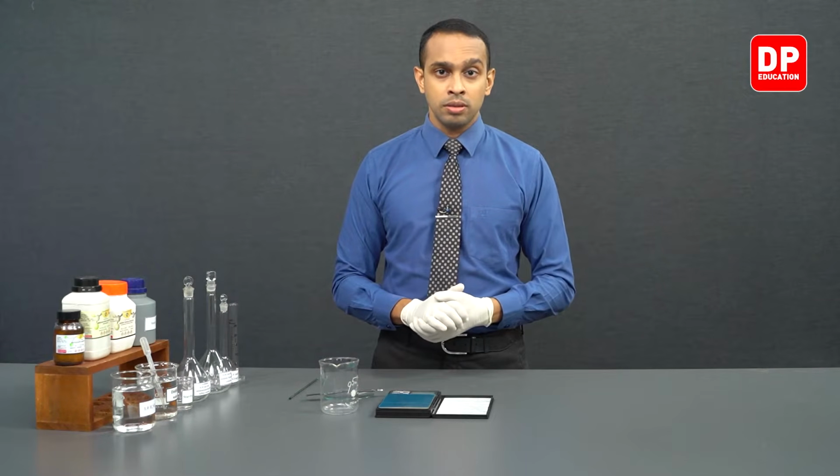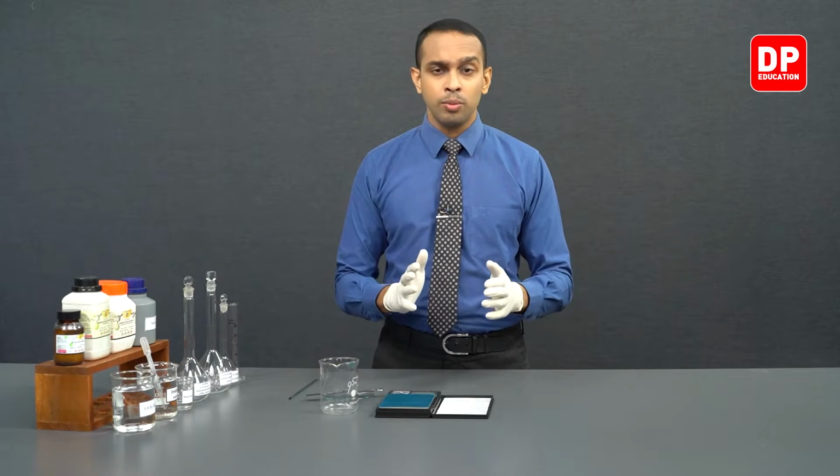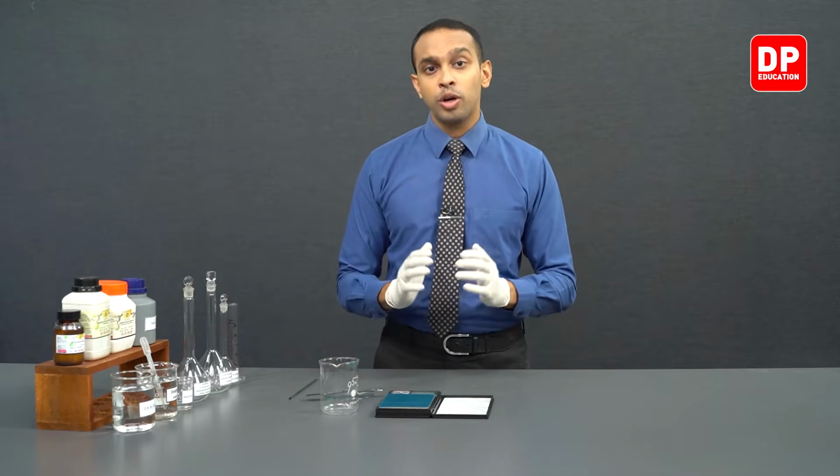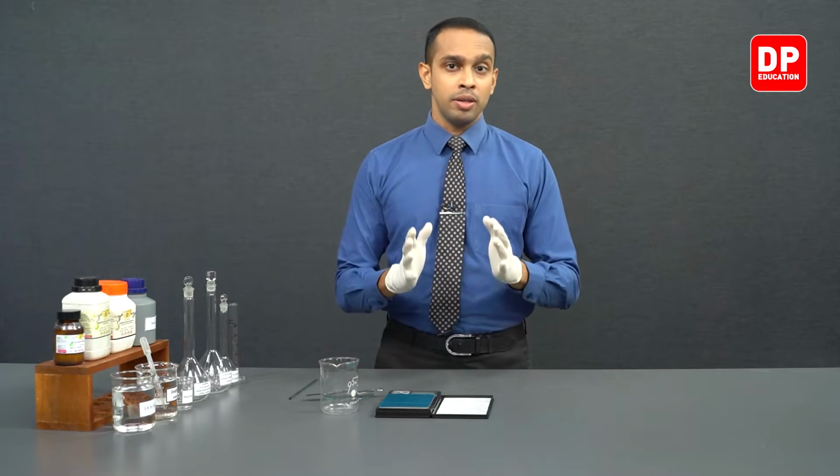In this first part, we are going to be preparing potassium iodide solution. The concentration we need is 3.0 moles per decimeter cubed, and we are going to prepare 100 milliliters of this solution.